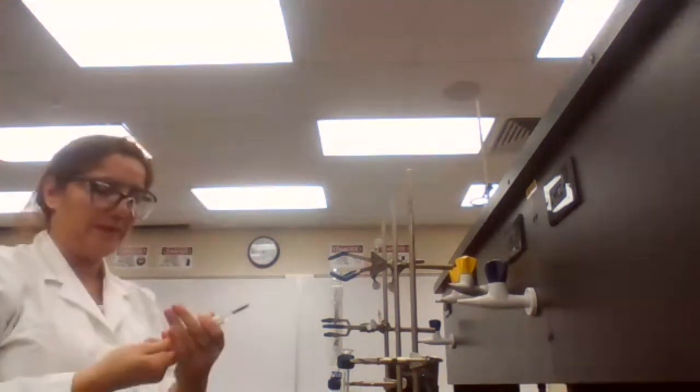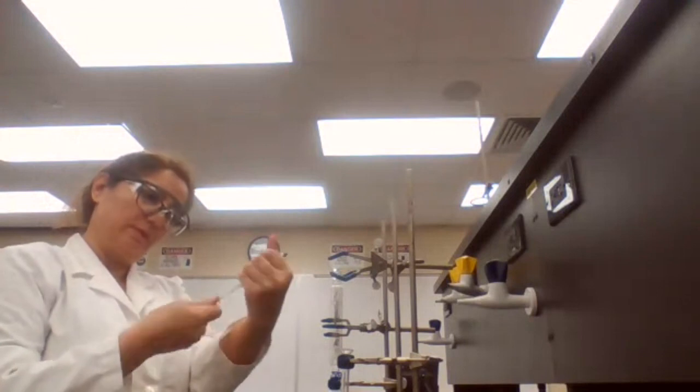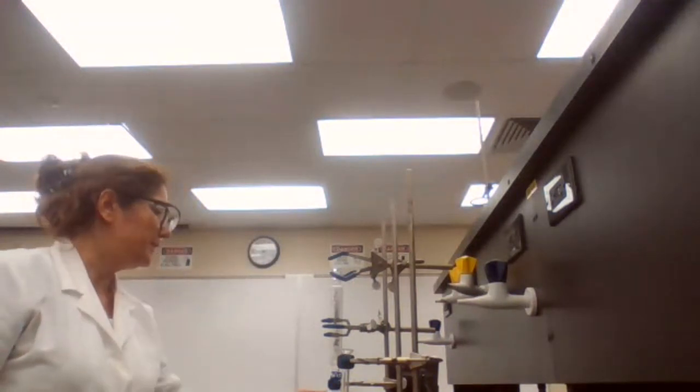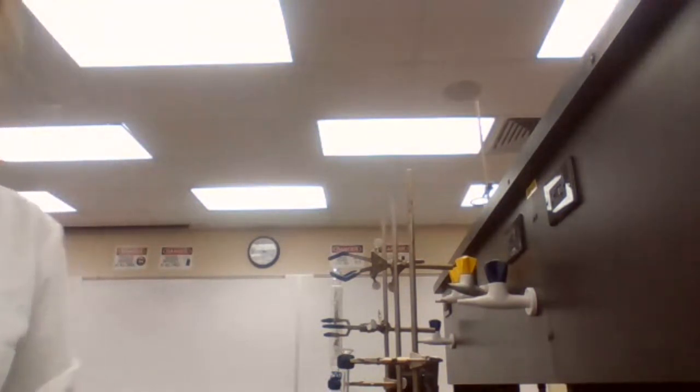To take the thermometer out, just twist and pull from the thermometer adapter. You twist it and pull to separate. This piece is still hot. I'm just going to give it a couple more minutes to cool down before I take it apart.